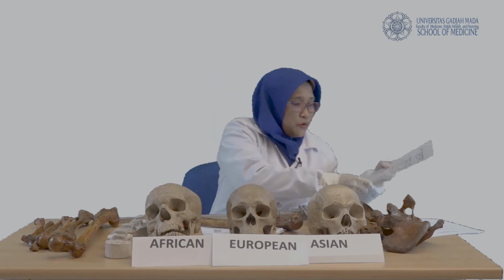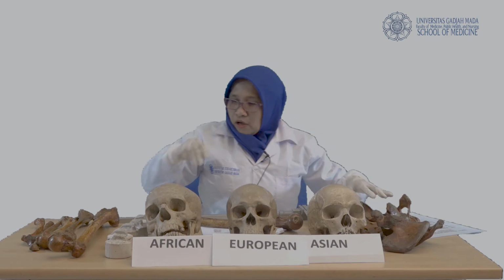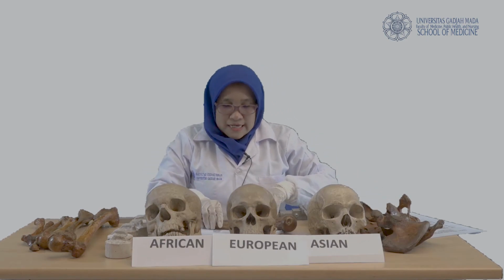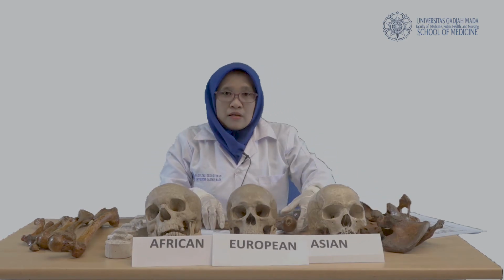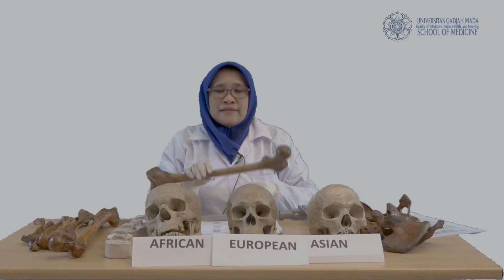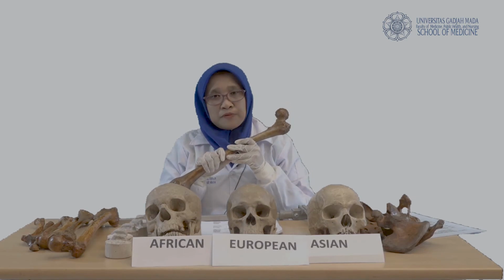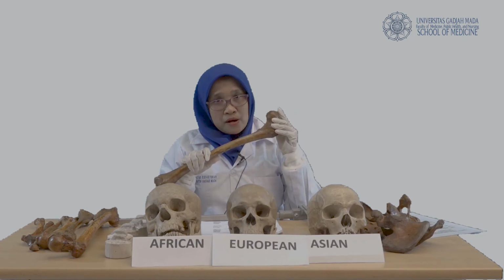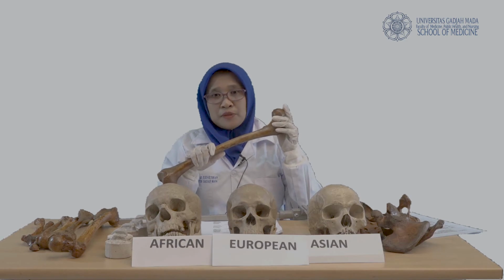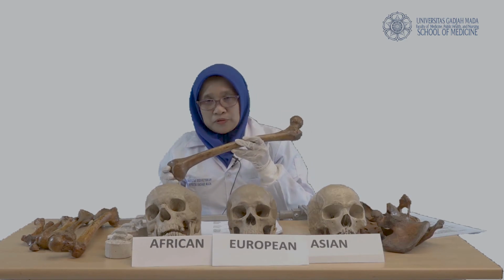Now I will show you how to take the measurements of the long bones. The measurement we use is the maximum length of the bones. The maximum length is the maximum distance between the most outer parts of the distal and the proximal parts of the bones.